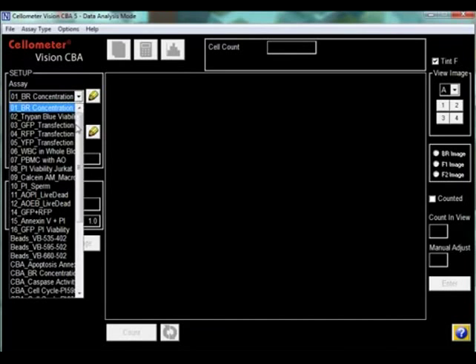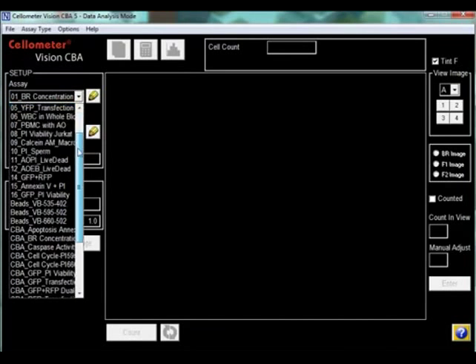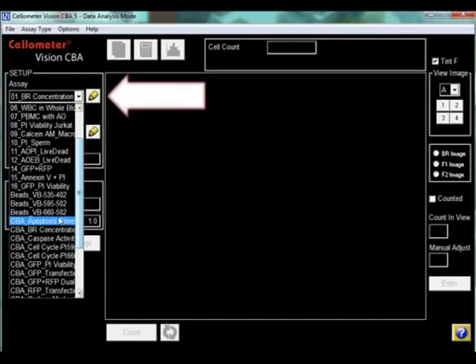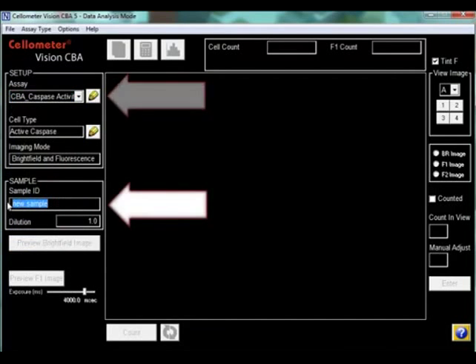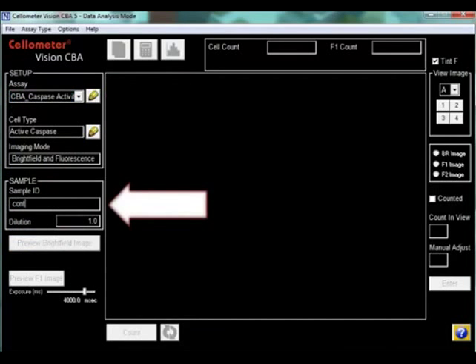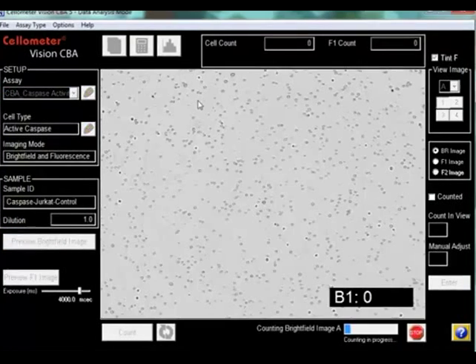To analyze a sample for active caspase-8, select the caspase assay from the drop-down menu, enter the sample ID, then click Count.